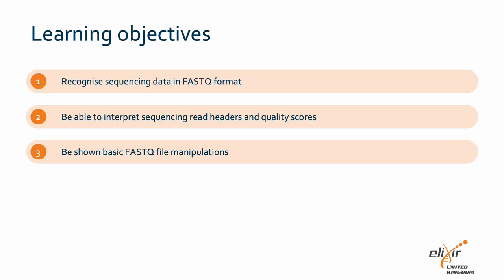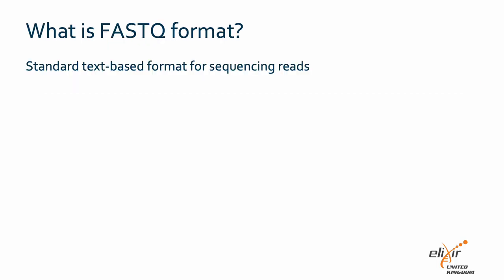In this RDMbite, you will learn about the data stored within FASTQ files. This includes raw sequence, sequence quality, as well as data on how the sequences were generated. We will also cover basic manipulation of FASTQ files.